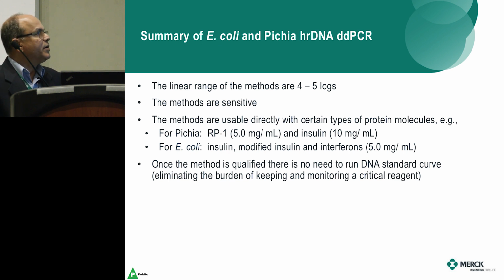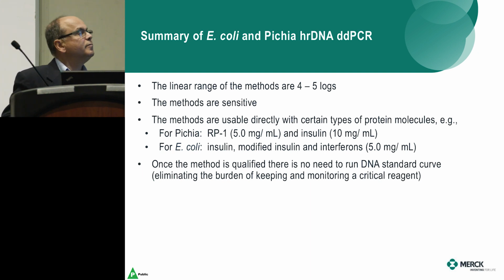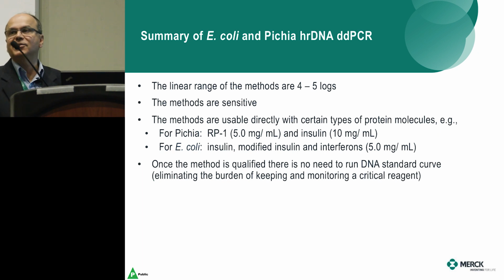Now, this is the summary showing that the range is pretty big enough for a good analytical method. It's sensitive, can be used widely with these drugs, and once the method is qualified, there is no need to run a DNA standard.